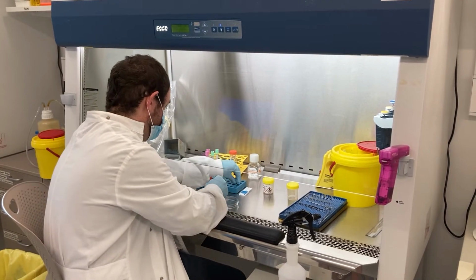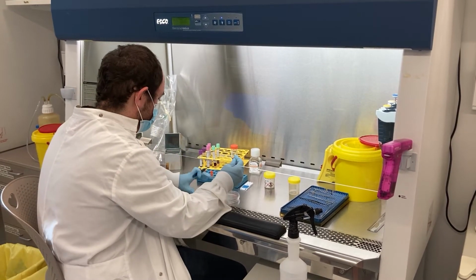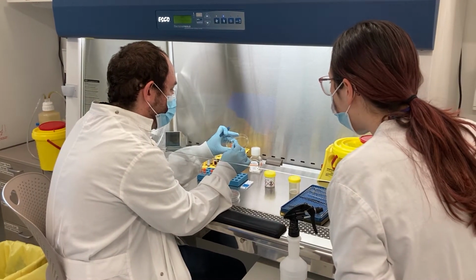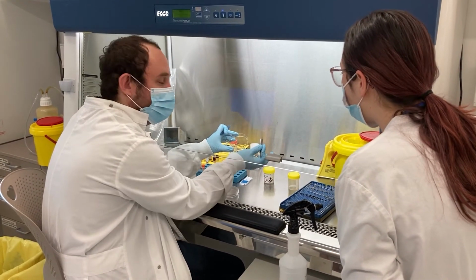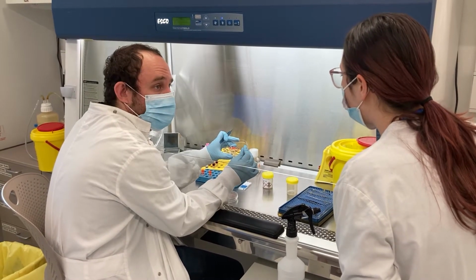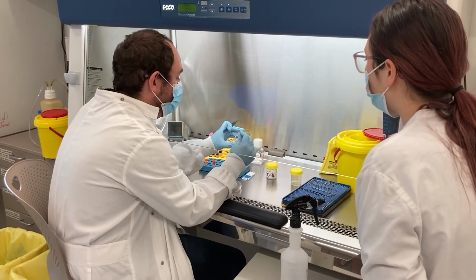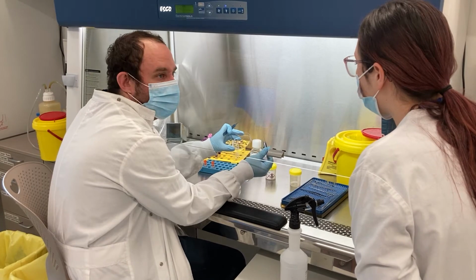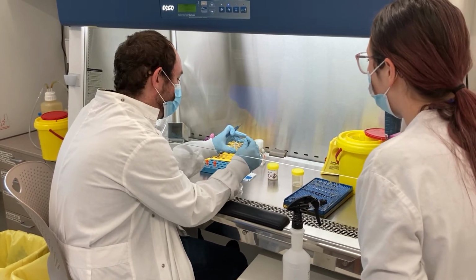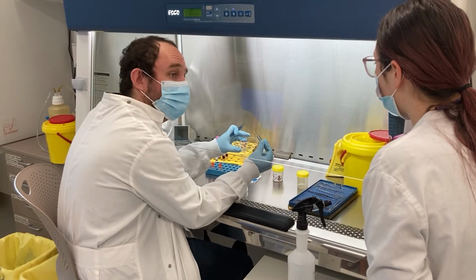Just dissecting it out. So Dani, if you look at this, all that black stuff is diathermy, so that's when the surgeons use a laser to take it out, and you can see the black necrosis. And all that pink stuff there is the live cells, we think. So this is an exophytic tumor, so very papillary, and we expect it to be quite alive and nice. You can tell by how juicy it looks in a way. So I might just go ahead and take a large section of that for histology.